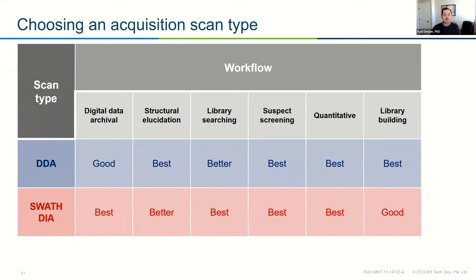And finally, something like library building. That's a place where information-dependent acquisition or data-dependent acquisition really shines, because we're really confident that we're collecting data on just that one specific ion.